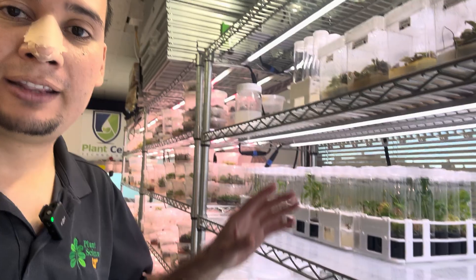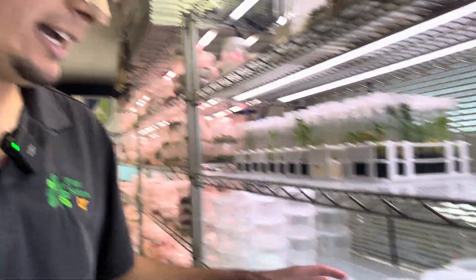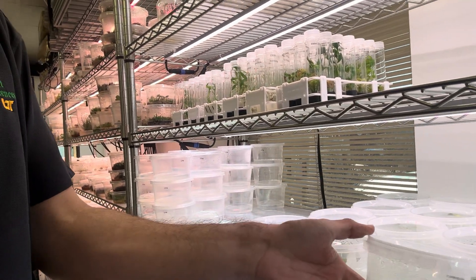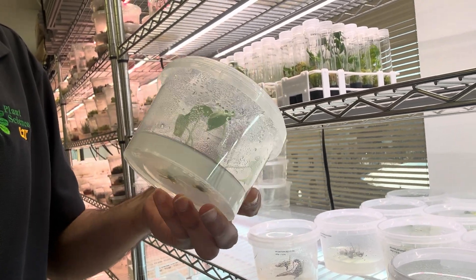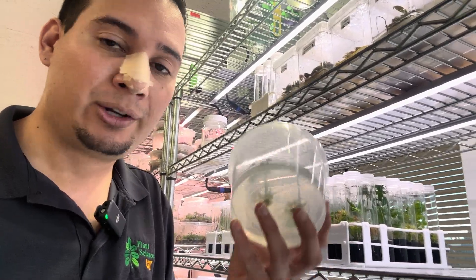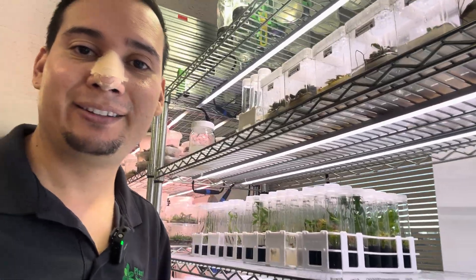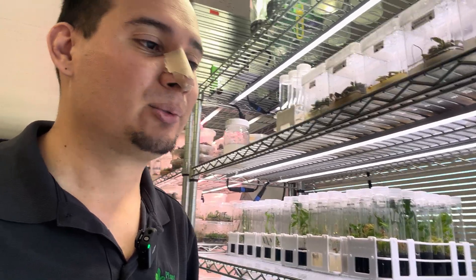Not only am I testing spicy tomato media, but I'm also testing new media for houseplants. I have experiments on different medias for houseplants and so far they're doing very well. They've only been here for not even a week, so I still have to wait longer. I'm testing different medias for different houseplants — a little bit more specialized media depending on the plants. We know that monsteras like different media than philodendrons and other plants. Very excited to have the results pretty soon and share those with you in the future.